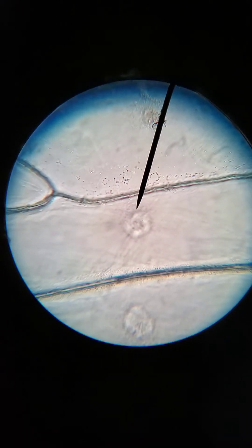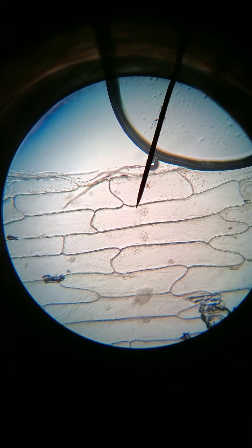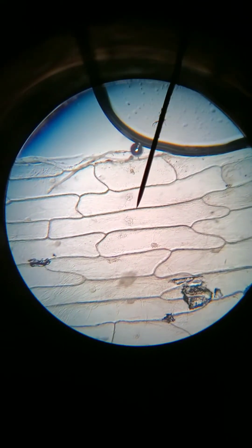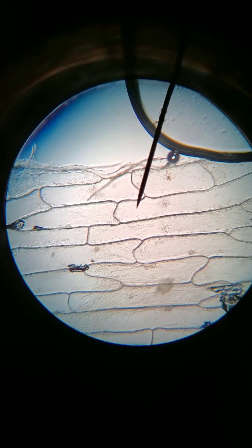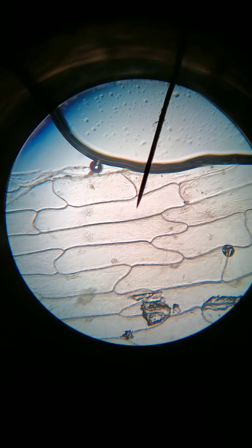We're going to go back to low power. On low power, we can see the whole cell — we have the nucleus right there, and the cell wall, and everything else inside is the cytoplasm. This liquid part is the cytoplasm. We know there's mitochondria there, vesicles, all sorts of other organelles, but we can't see them with our light microscope even if we magnify it 400 times.